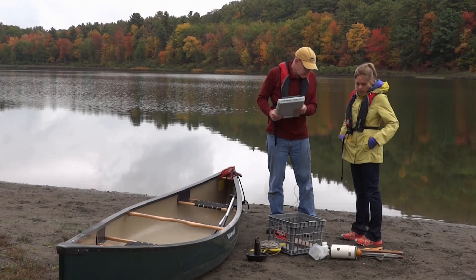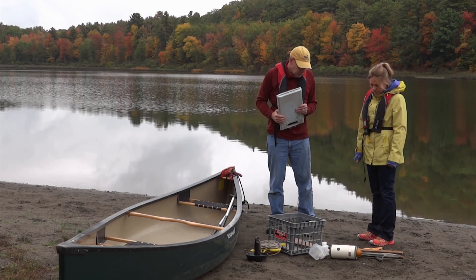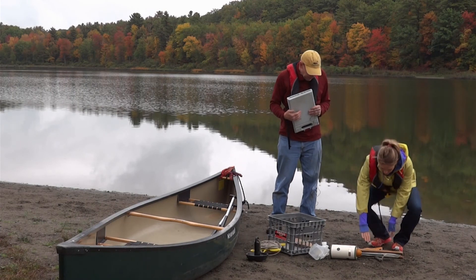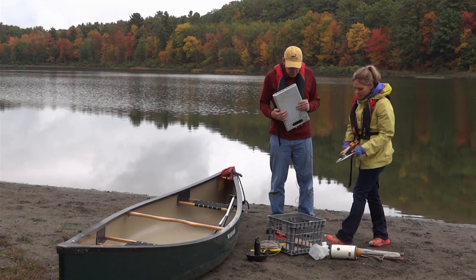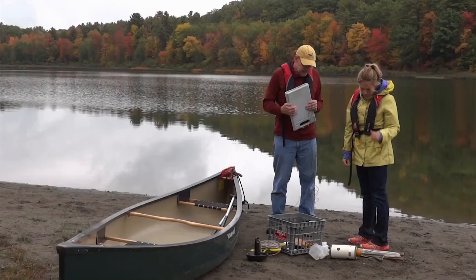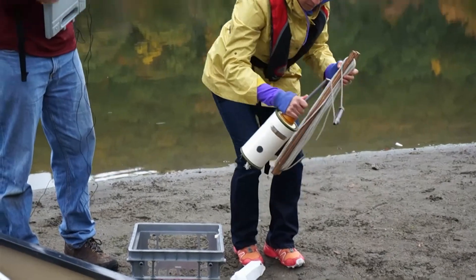I'm going to take Karen through all of the procedures for collecting a water sample, and then we'll go through procedures about how to process a water sample. The first step in the process is to make sure that we have all the equipment we need to go out on the boat. The first thing we want is a Secchi disc, which we'll place into a crate. The second thing we need is the Kemmerer bottle, which we'll use to collect the water sample, so we'll place that in the crate as well.